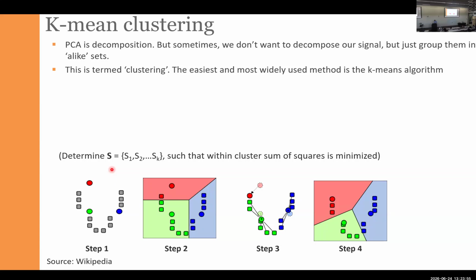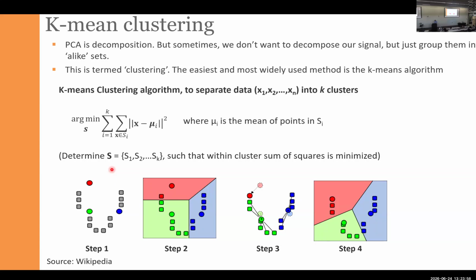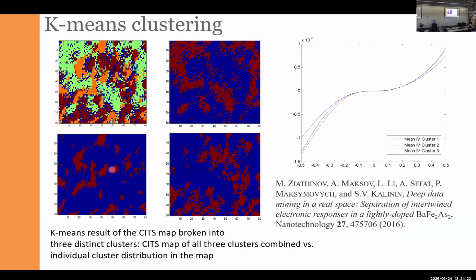Now, when we talk about the PCA, it's also important to bring up the connection between the PCA and the clustering methods. PCA tries to disassemble your data set into the products of loadings and components. Clustering methods try to basically take your data set and ascribe a label for each instance of the data in the data set. So clustering is super useful.